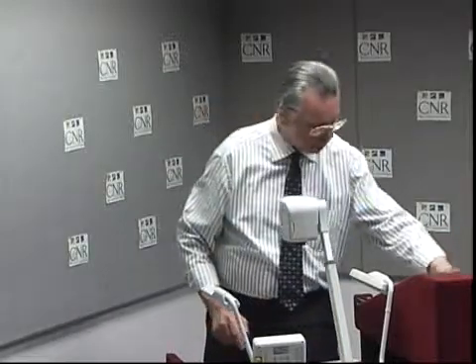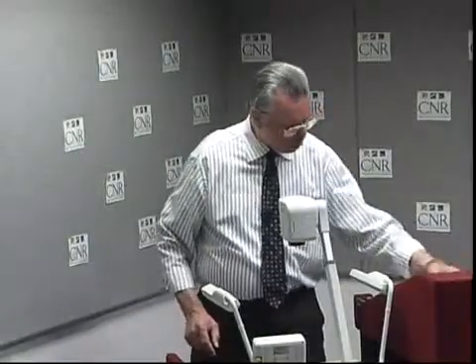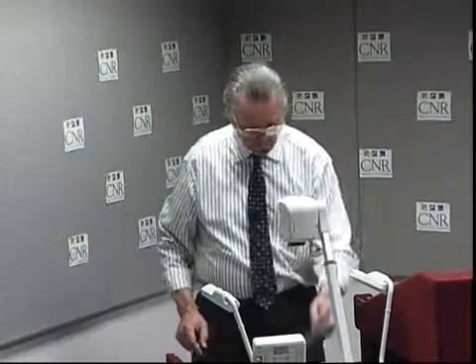But we use the card to warm up the scanner, and that is in the regular procedure for the calibration, and you will be prompted by the software to load the white card in and then the black card. And the black card, you see here, is not very good on the reflectance with the light, but this is black. And then you are also provided with light gray dots, which you can hardly see in this image.